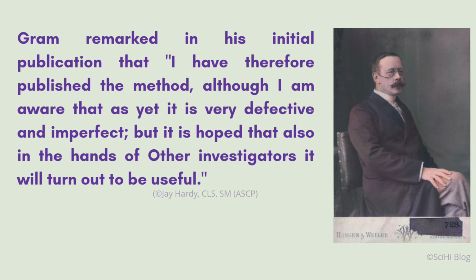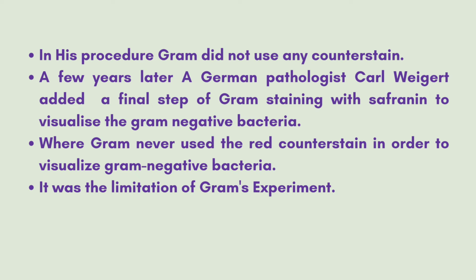Gram remarked in his initial publication, "I have therefore published the method, although I am aware that as yet it is very defective and imperfect, but it is hoped that also in the hands of other investigators it will turn out to be useful." In his procedure, Gram did not use any counterstain, so it was a limitation of Gram's experiment. A few years later, German pathologist Karl Weigert added a final step to gram staining with safranin to visualize the gram-negative bacteria.